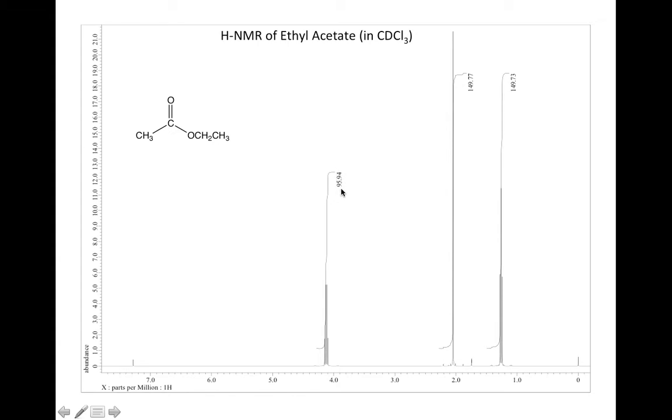So although this would be too big, you could imagine that might be 95 millimeters, and that would be 150 millimeters, measuring from there to there. In this case, the NMR has already arbitrarily picked some relative scale and put some numbers on there. Now, what we want to do is think about how those numbers correspond to the number of protons in the molecule.